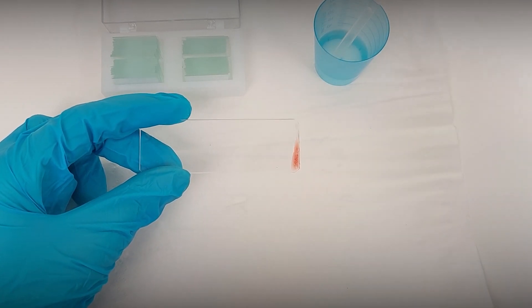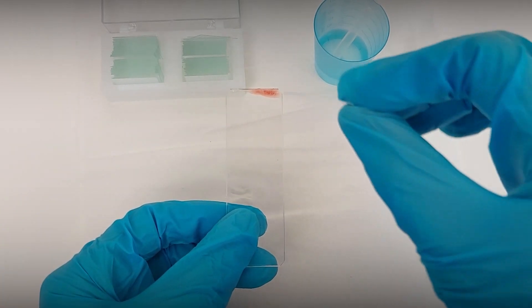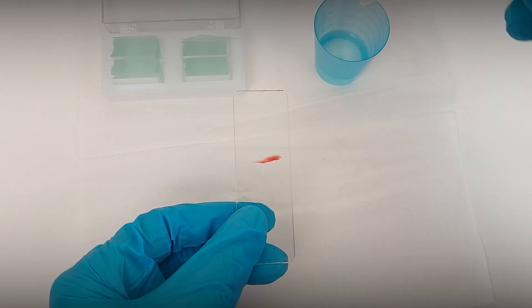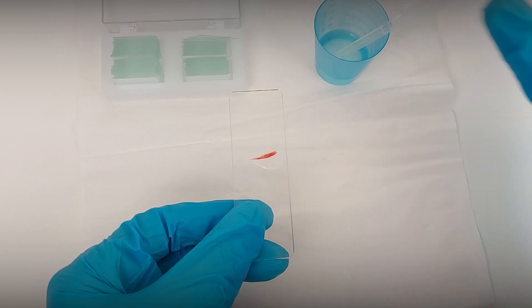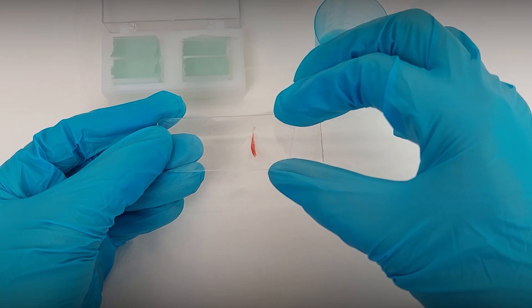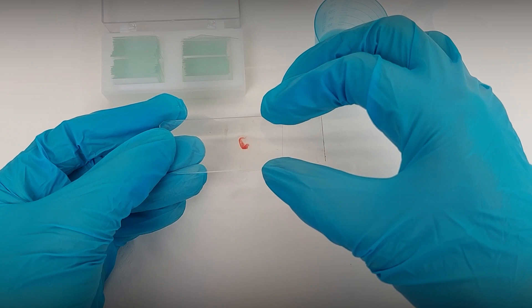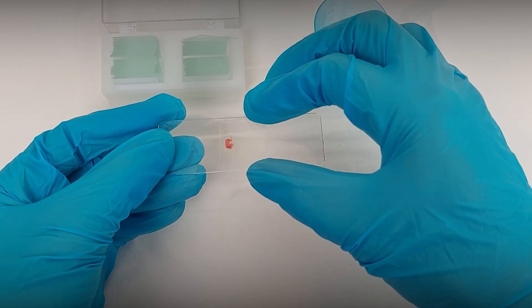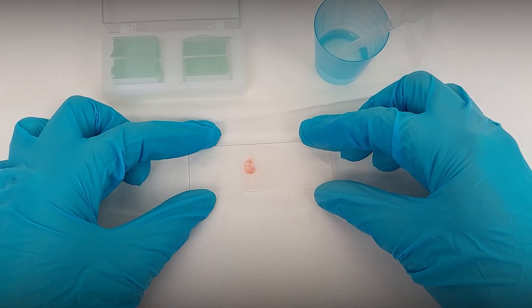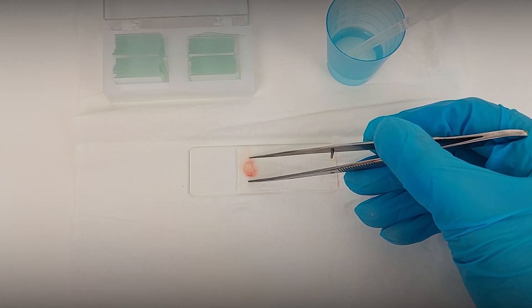Now, using a cover glass, move the sample to the middle of the slide. If there is not enough liquid, use a pipette to put a drop of water onto the middle of the slide and lower the cover glass. Press gently with the tweezers to distribute the smear between the cover glass and the slide.